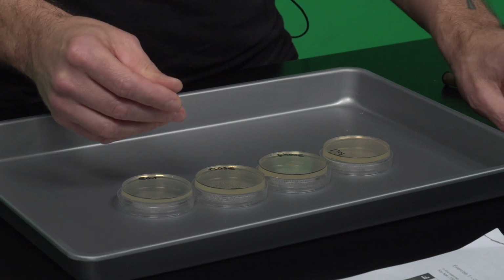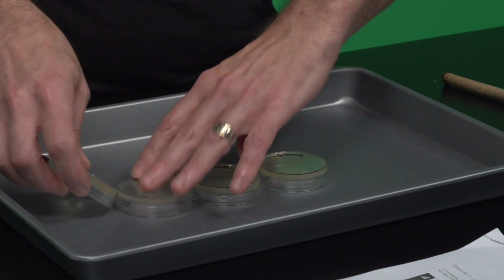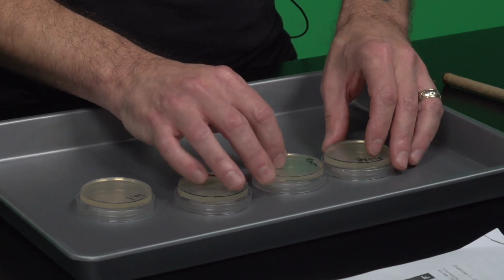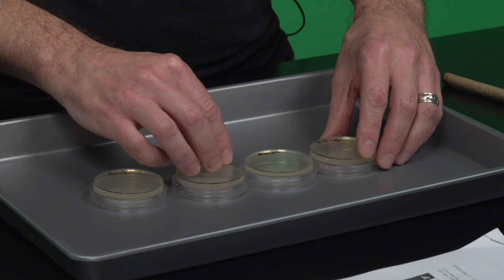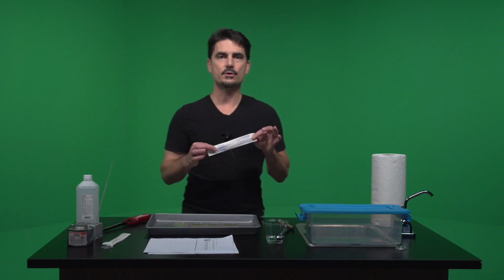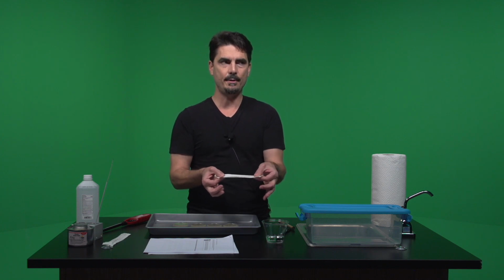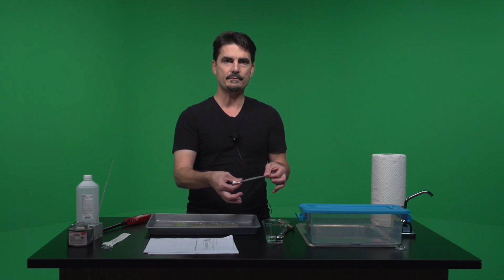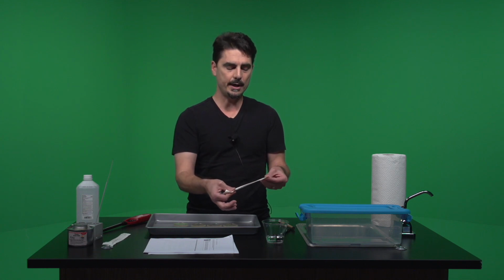First, let's swab from my body. I'm going to do my nose, ear, phone, and then soil. What we need then are some of these swabs, and as the instructions say, feel them. This is the hard part right here, and this is the soft, swabby part, so definitely this is not the part you want to open.